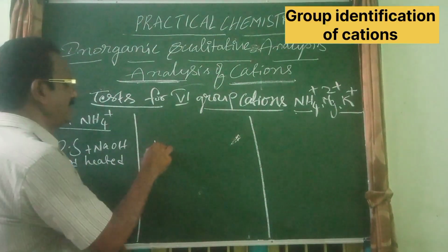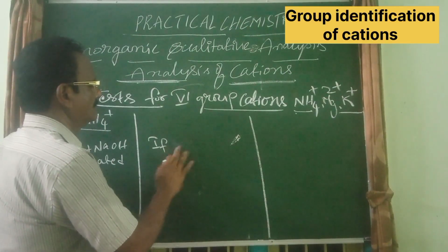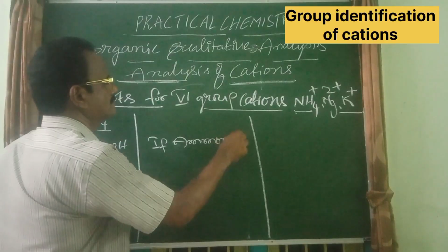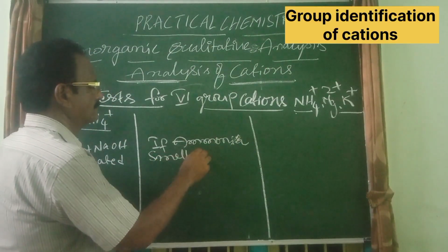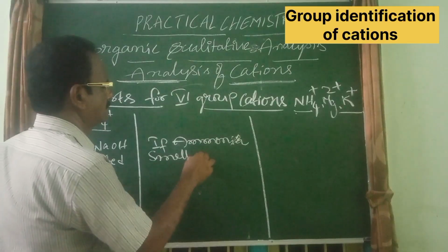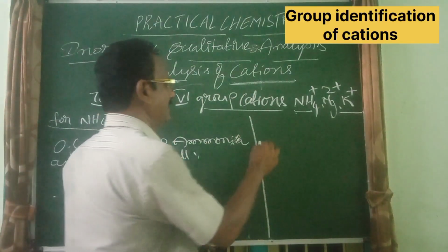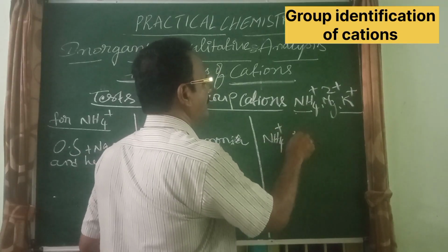If you get ammonia smell, if ammonia smell is there, then the presence of NH4 plus is confirmed.